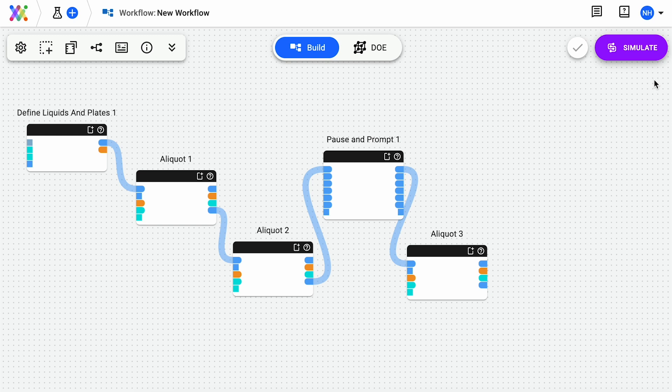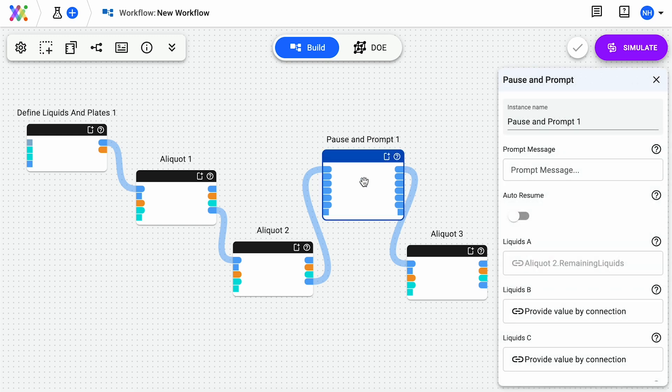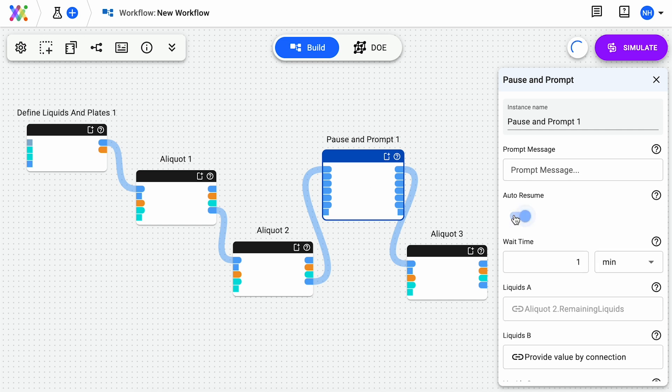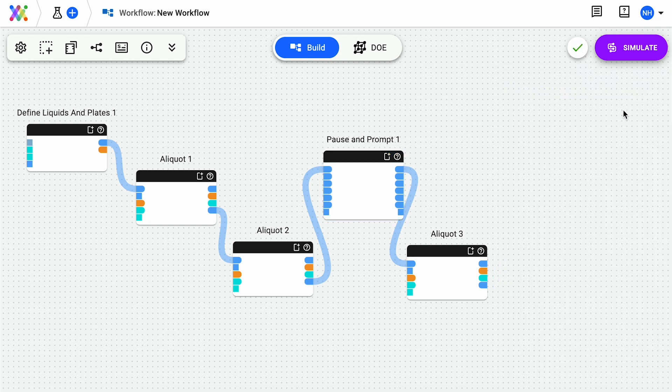You can also add a pause and prompt element to add a pause in between plates. If you want the Tempest to automatically continue after the pause, click Auto Resume, or untoggle this if you want to manually resume after the pause. If you're using a pause and prompt element, this will always need to be in between two elements.